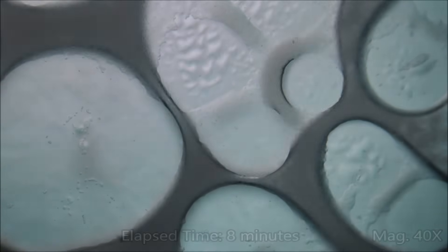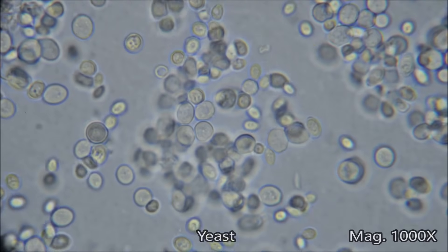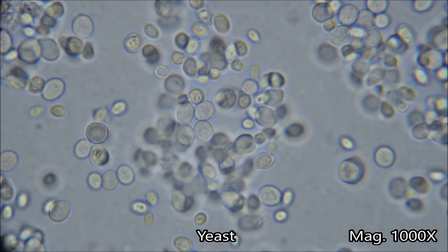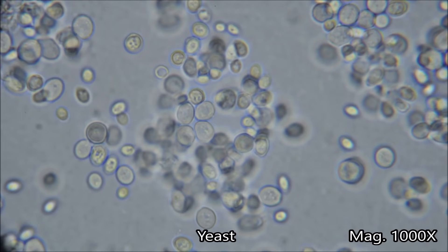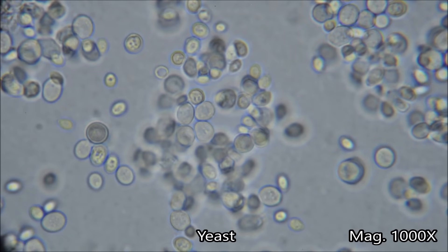So whether it is making bread, beer, or wine, these little guys are the ones responsible for it, and their most visible action is the carbon dioxide they produce. And when viewed under a microscope, they produce beautiful images.